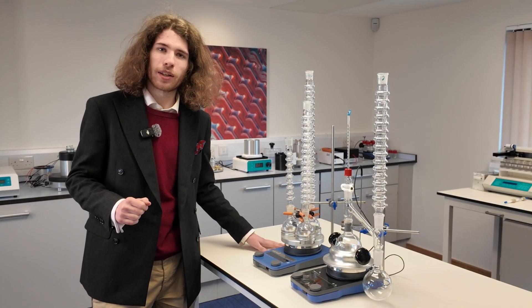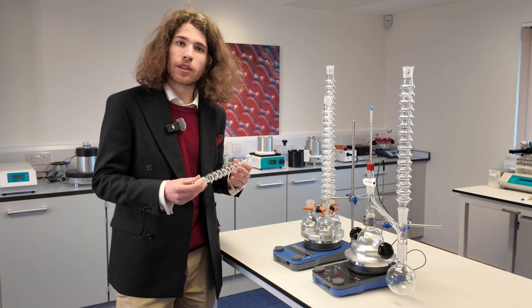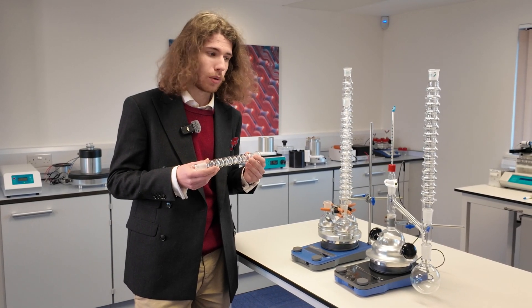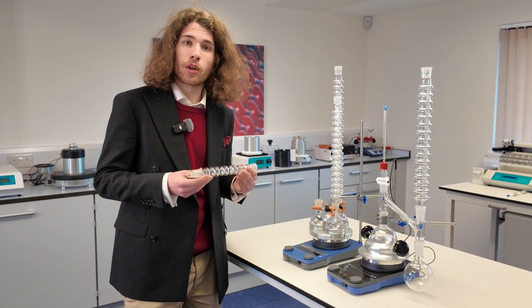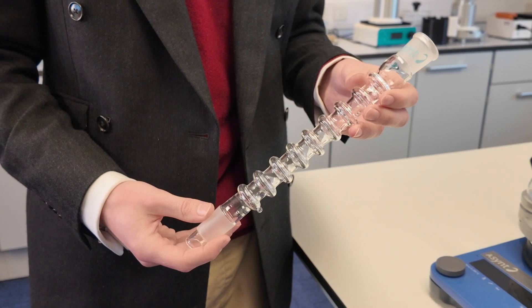In addition to the variable sizing, the Condenser also has different shaped sockets, so it can work with pretty much any round-bottom flasks you require, as well as distillation adapters. We have British sizing as well as American fittings too.